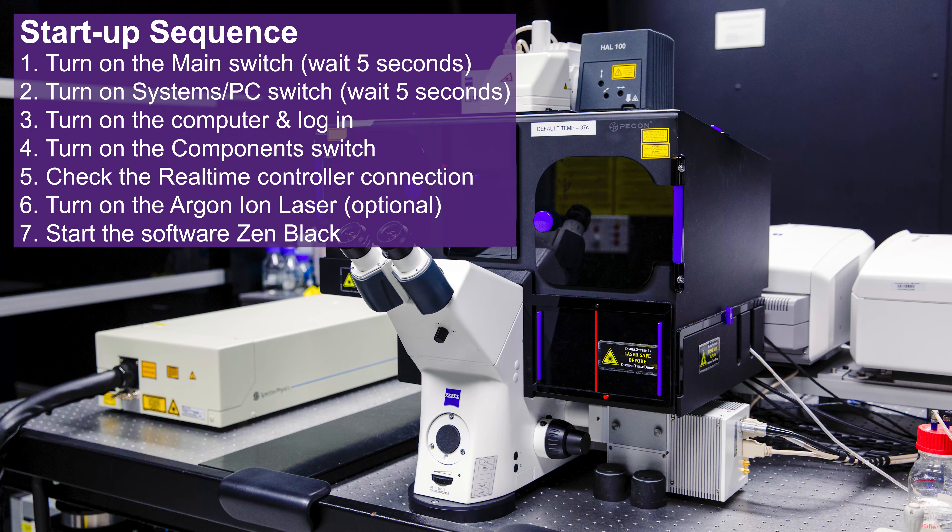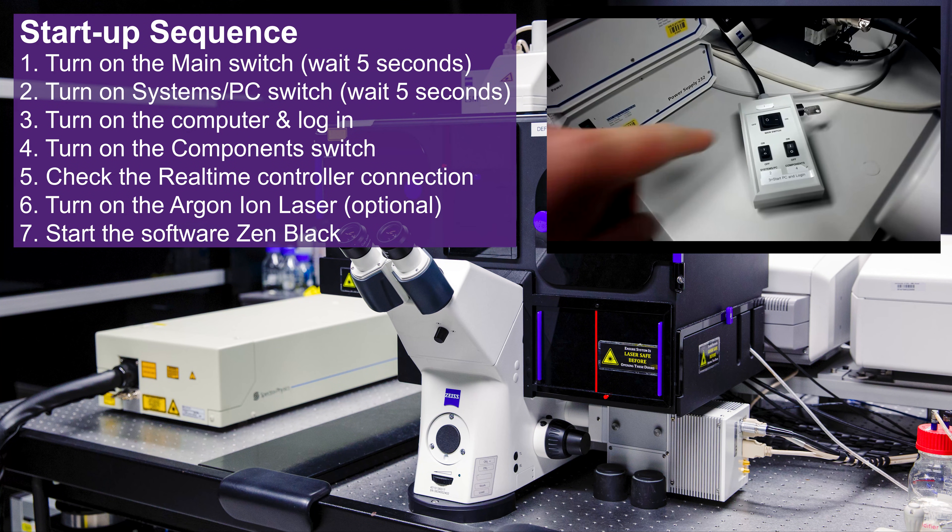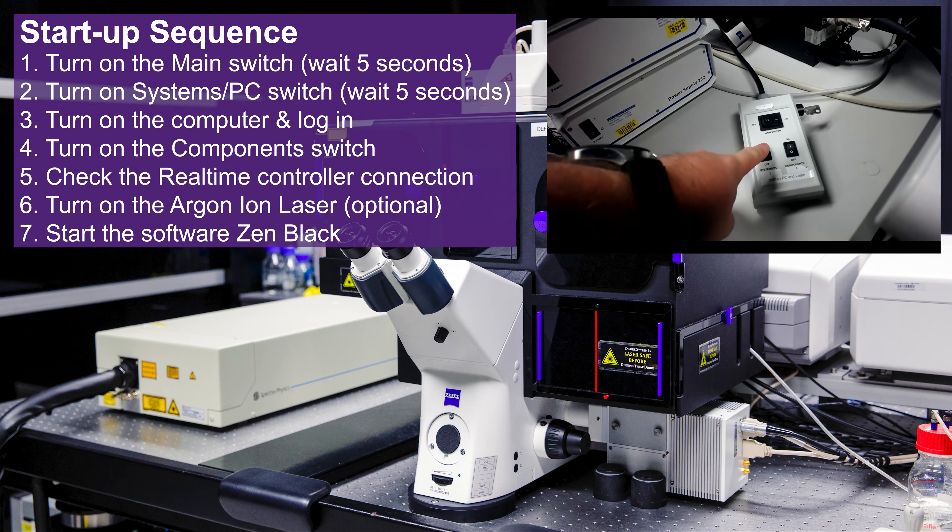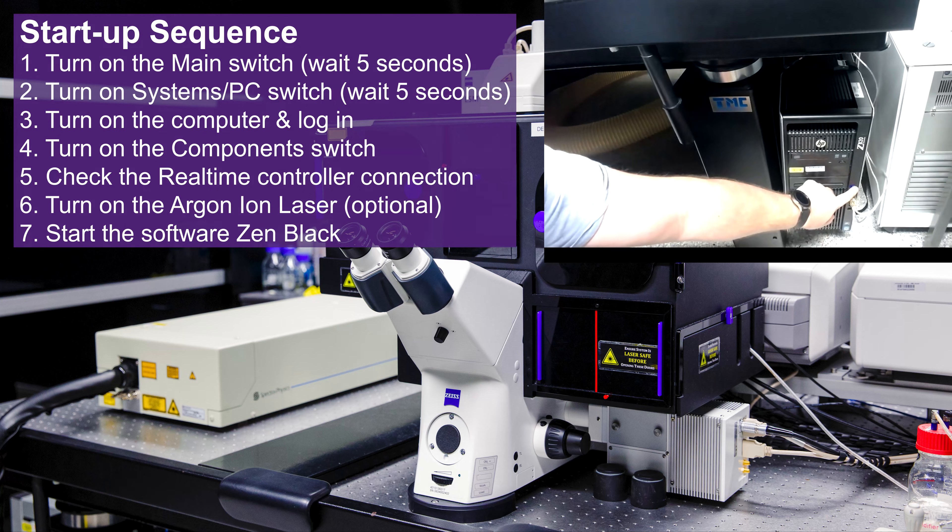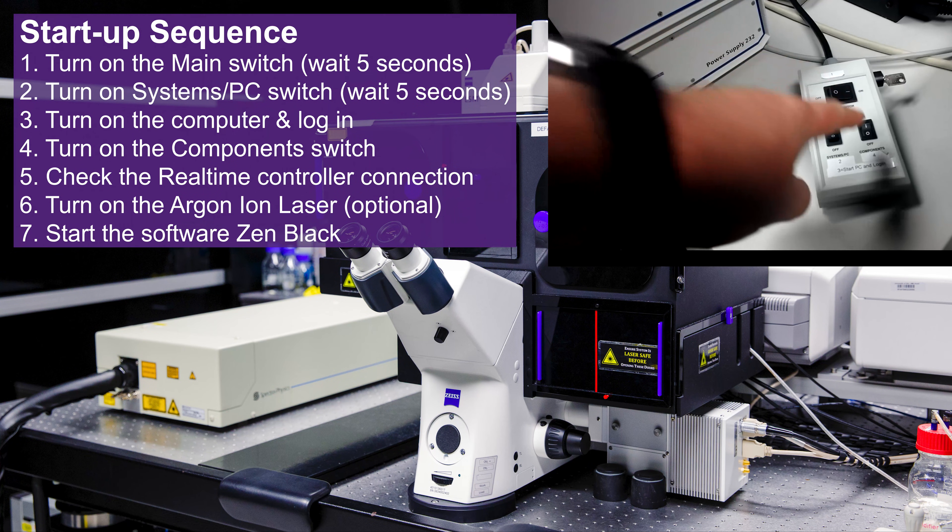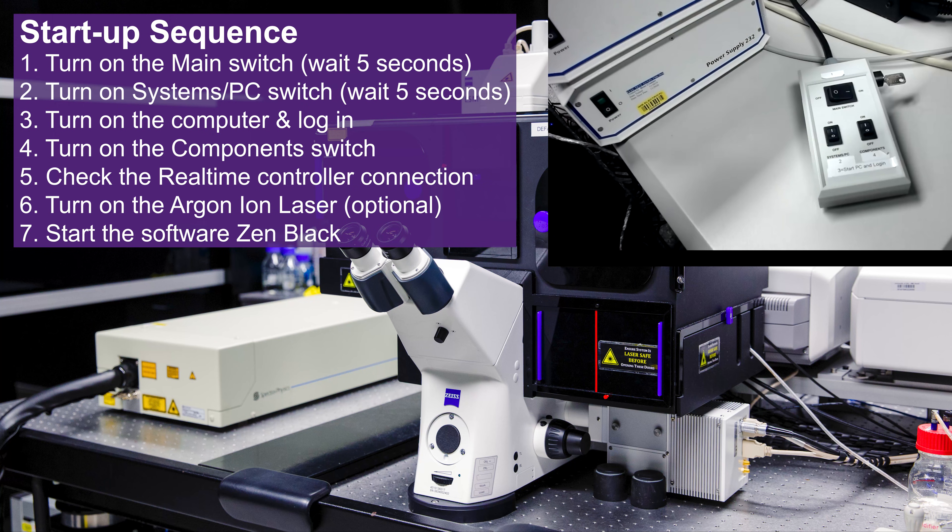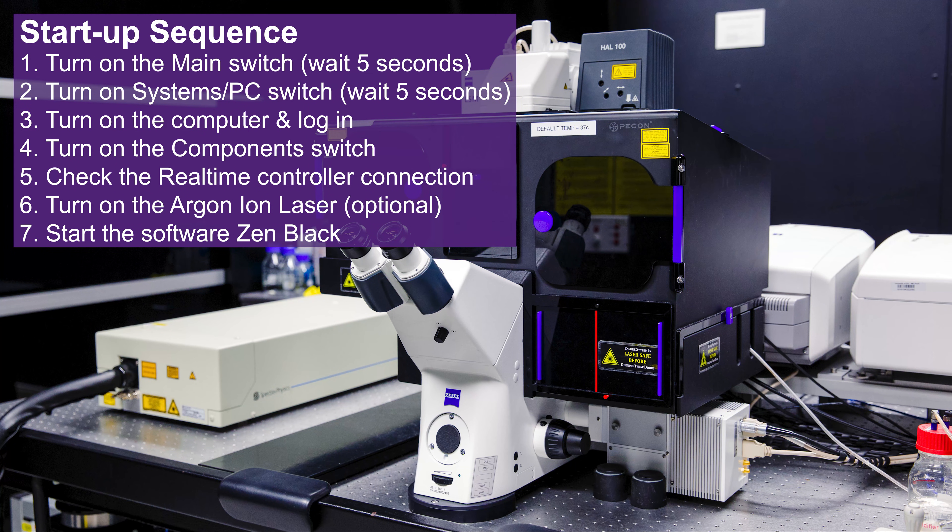These systems require very specific startup sequences to ensure all devices turn on and connect to the software in the right order to ensure smooth, consistent imaging sessions. Firstly, turn on the main switch, followed by the systems PC switch a few seconds later. Then turn on the computer and log in. After logging into the computer, turn on the final switch components and wait at least 30 seconds for the real-time controller to connect.